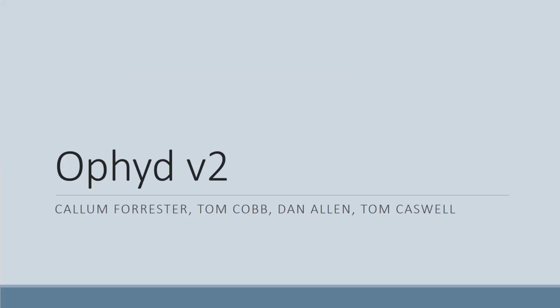Cool. Hi everyone, I'm here to talk about Ophyd v2, which is a library in development by these people. Predominantly my colleague Tom Cobb at Diamond Light Source, but also with significant input from NSLS-II, the originators of the Bluesky framework, of which this is a part.